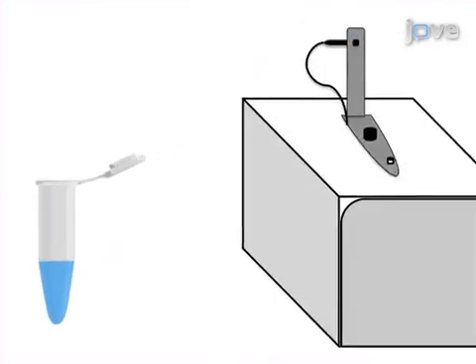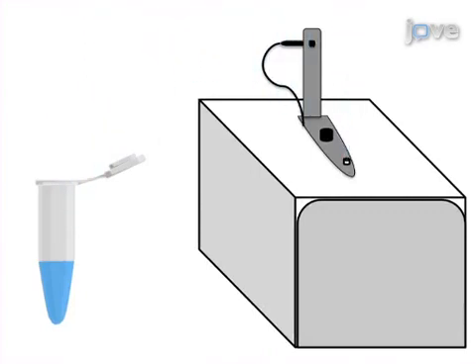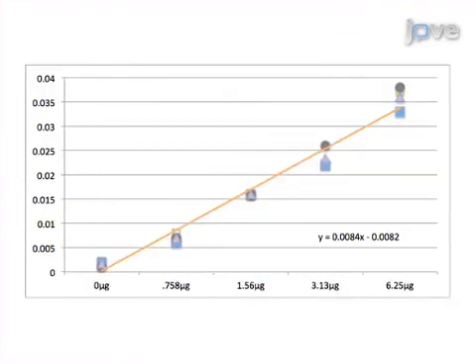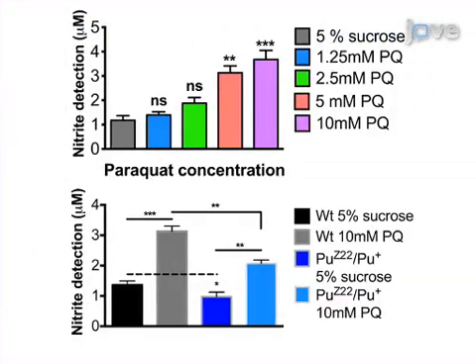Next, measure the absorbance of the colored reaction product and quantify the values against a standard curve for nitrite concentration. Ultimately, this colorimetric assay is used to show the endogenous catalytic activity of nitric oxide synthase.